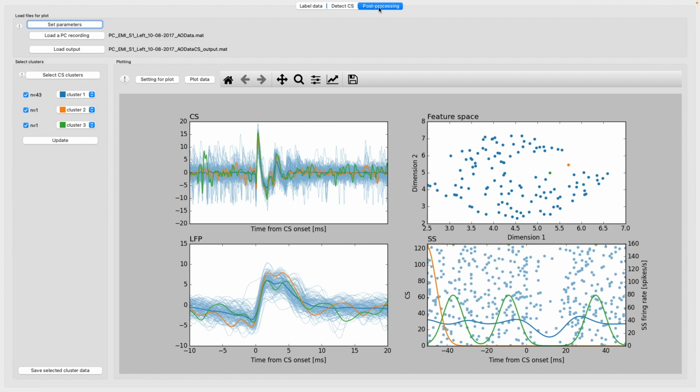You don't have to do all of this on one day in one go. Which basically simulates our real conditions, because many times you don't have that much time to sit on one day and label 100 cells. So you can obviously do this on separate days and find time at your convenience to perform each step.